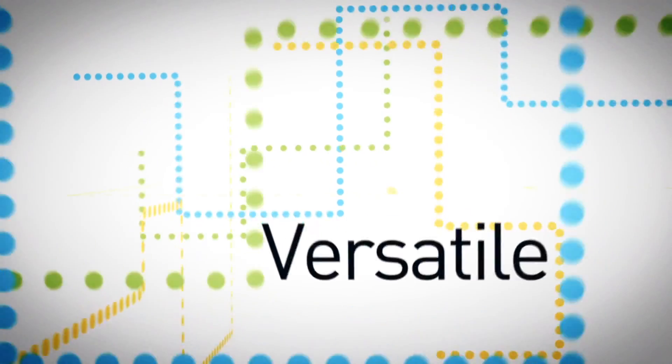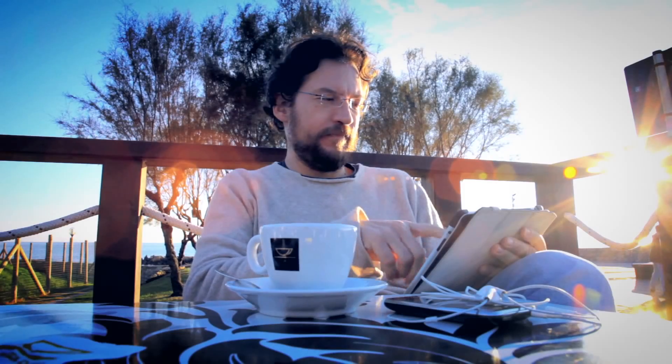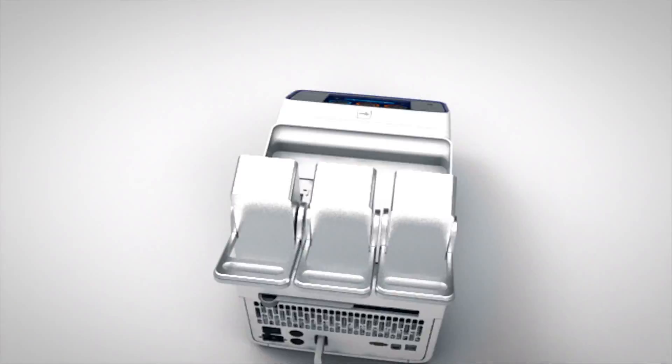That would be like science on your terms, versatile, connected, and ready when you are. Science that suits your lifestyle. What if that time could be now? Proflex PCR system, the what if, is now.